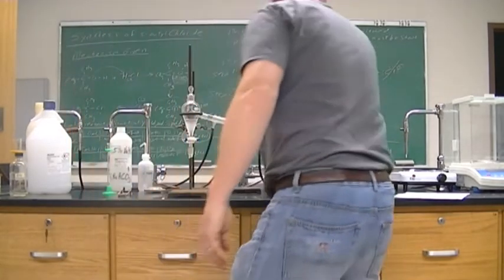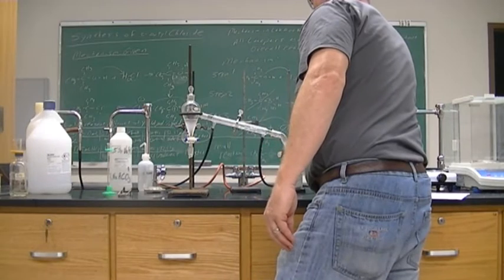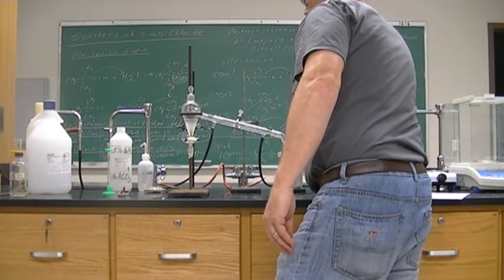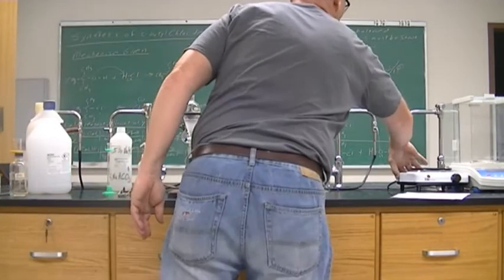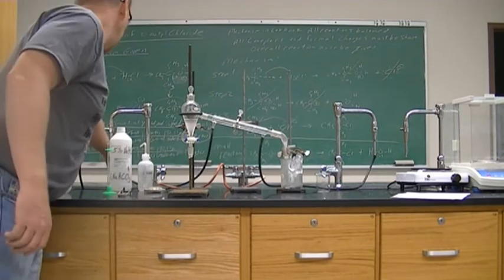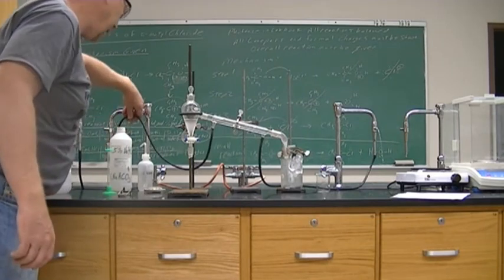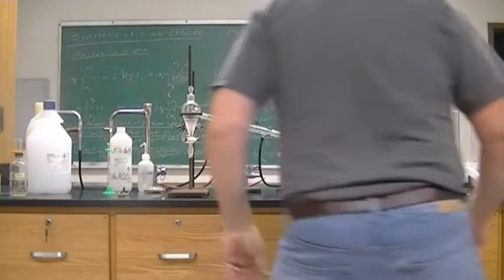And when you turn on this water, it doesn't need to be going very fast. All right, so that's good. Just have water going through. Does not need to be flying through there. And you can check the other side coming out, and that is plenty, if not too much water coming out.